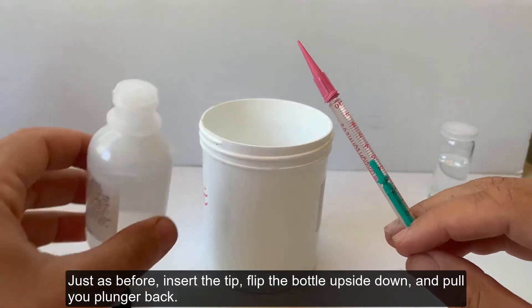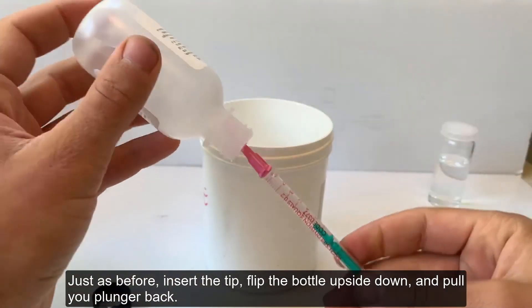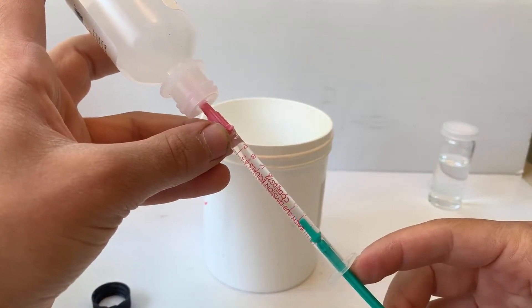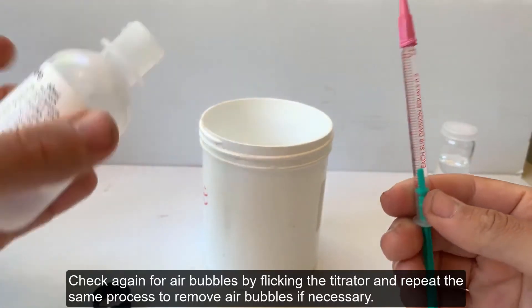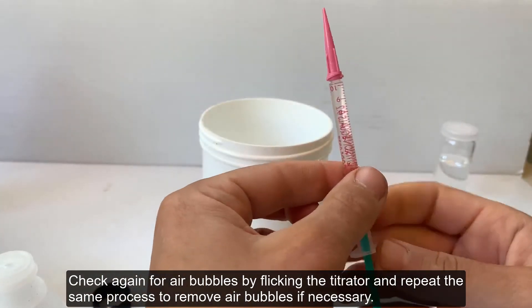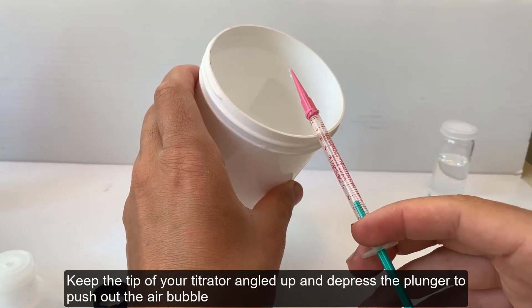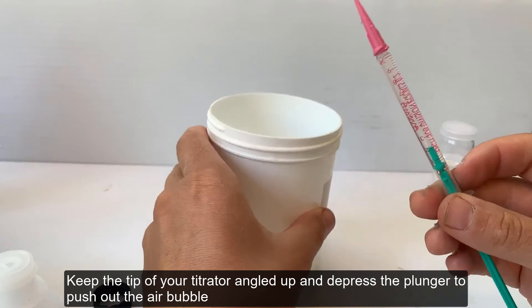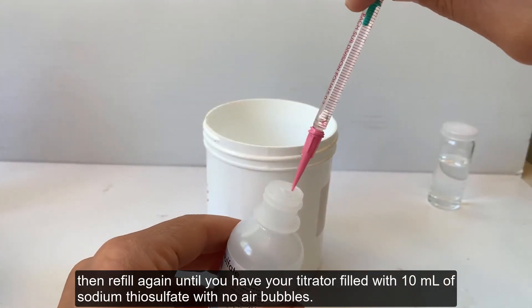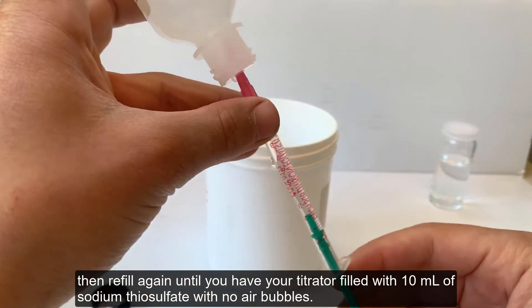Just as before, insert the tip, flip the bottle upside down, and pull your plunger back. Check again for air bubbles by flicking the titrator, and repeat the same process to remove air bubbles if necessary. Keep the tip of your titrator angled up and depress the plunger to push out the air bubble, then refill again until you have your titrator filled with 10 milliliters of sodium thiosulfate with no air bubbles.